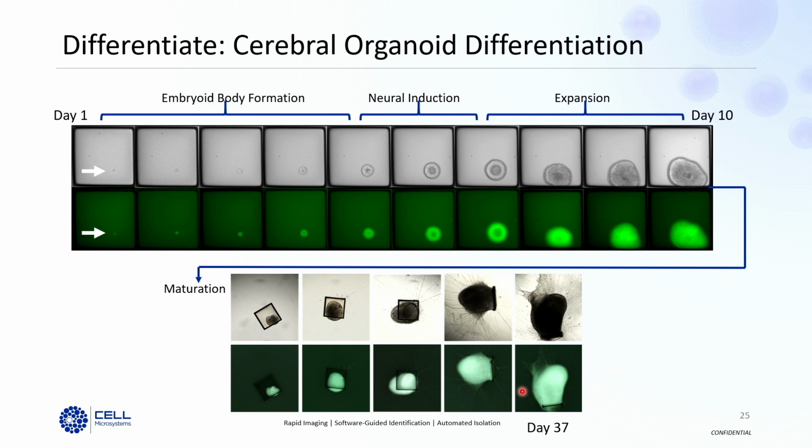Down the road, is there any possibility to use this for UHTS screening? For what kind of screening? High throughput screening. We get asked this a lot: can we isolate into 384 well plates? I think a lot of it can be mindset oriented. A lot of people think you have a 96 well plate with a clone or an organoid, and that a percentage of them will not survive. But with the way and the timing of when we isolate, basically every well of a 96 well plate is going to grow for you. So there's far less loss of targets.